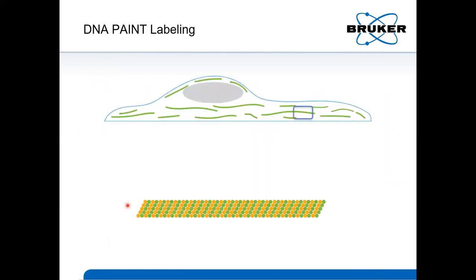Here we see antibodies labeled with a DNA barcode in yellow and a solution of complementary oligos bearing a fluorescent tag. These probes are short enough so that during the course of imaging, they bind and fall off the DNA barcode, allowing bound probes to be imaged and localized.